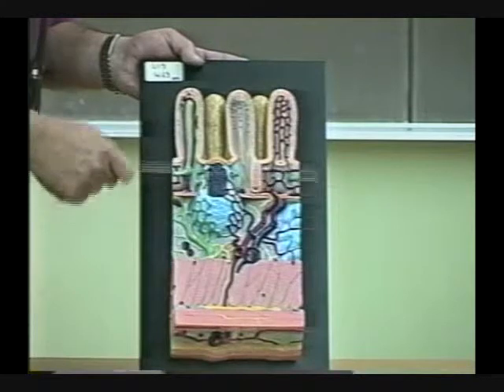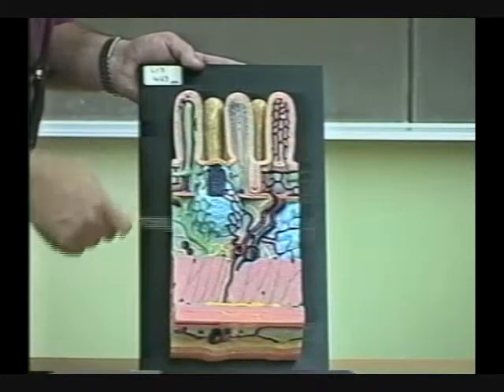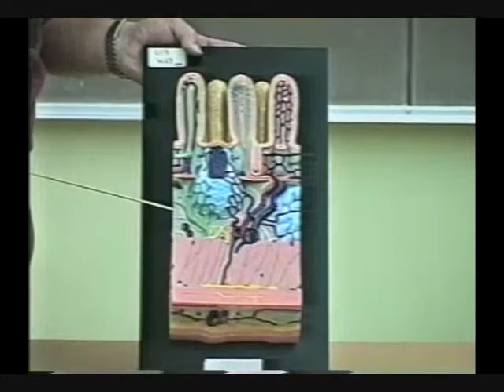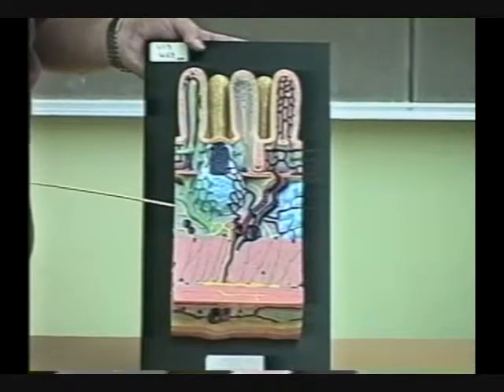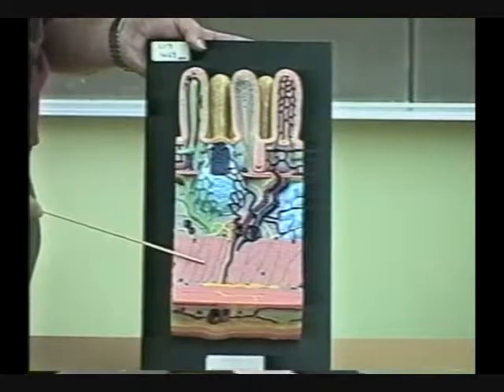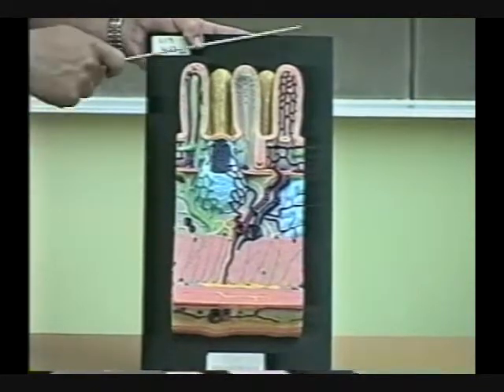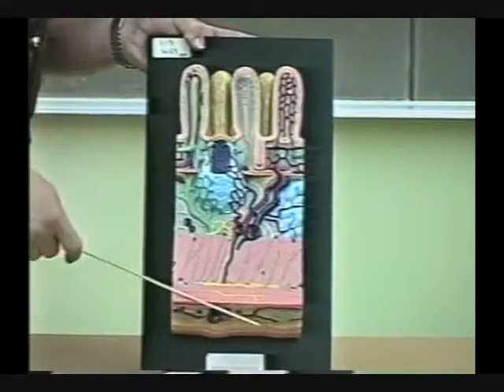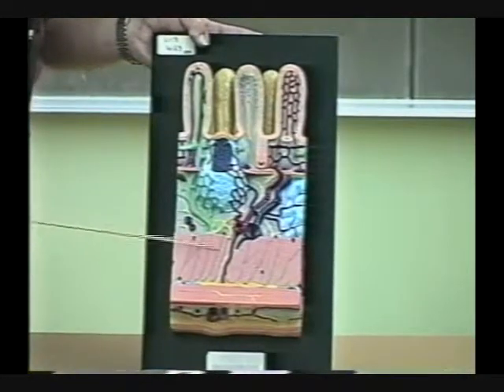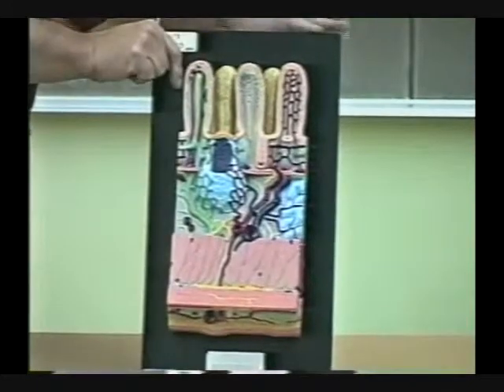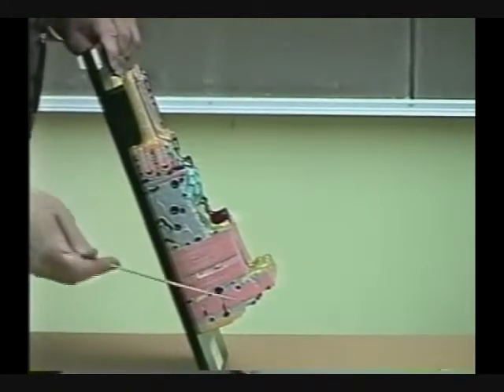What tunic is this? Tunica mucosa. This layer? Muscularis mucosa. This tunic? Submucosa — connective tissue, dense white fibrous, or even loose. It's somewhere between dense and loose connective tissue. Tissue here? Smooth muscle. Is this circular or longitudinal? Circular. Therefore, what perspective are you looking at here? It's a longitudinal section — longitudinal cuts crosswise and follows the longitudinal. If I rotate it 90 degrees, now you're looking at the cross section that follows the circular and cuts across the longitudinal.